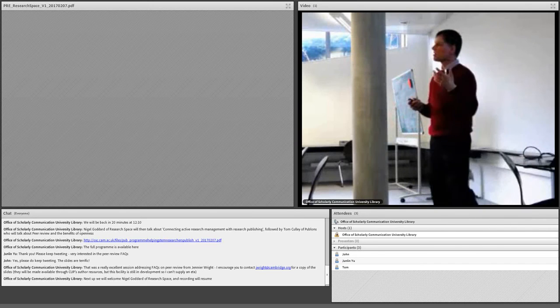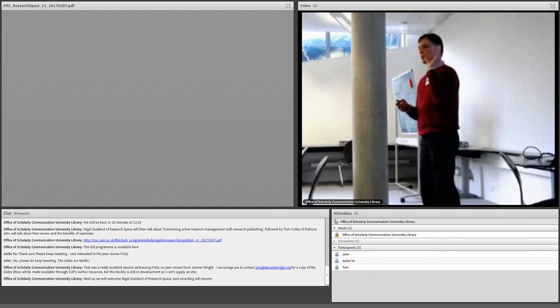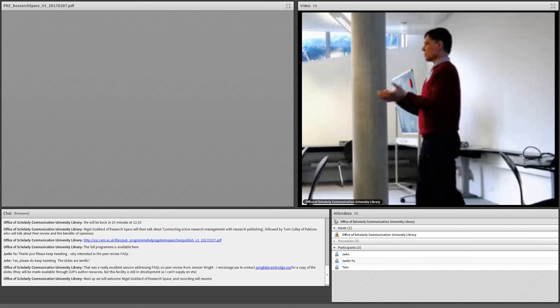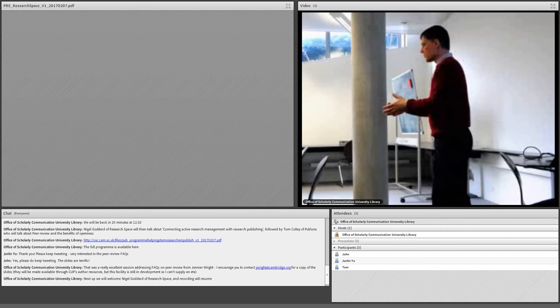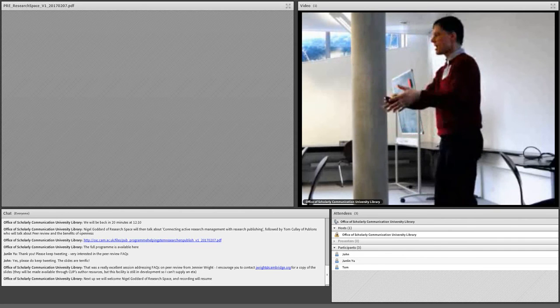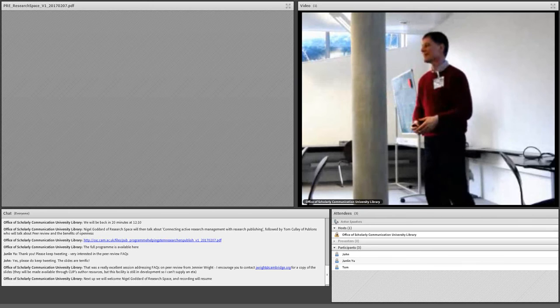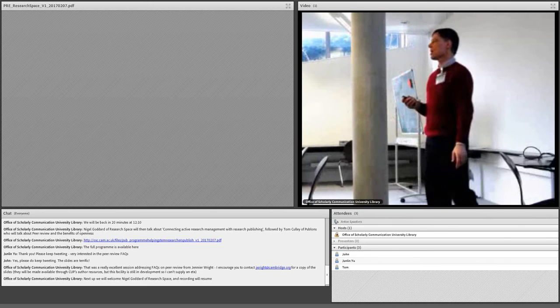Whereas 10 years ago, it was quite common in a biology lab that you would take your Western blot image that you've gotten on some machine, and you would print it out as a piece of paper, which you would then paste with glue into your paper notebook. So we're now kind of beyond that.